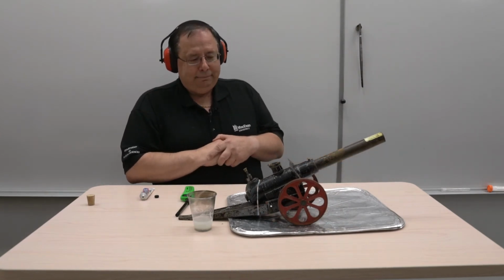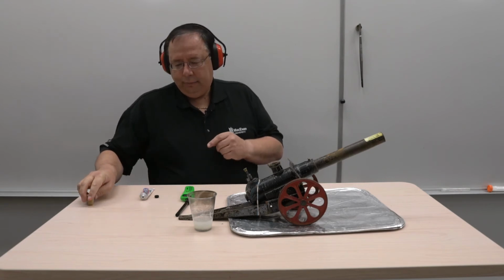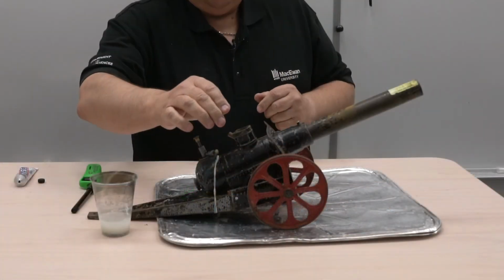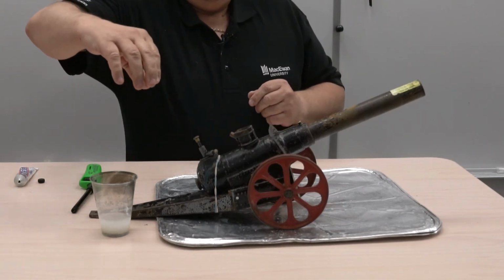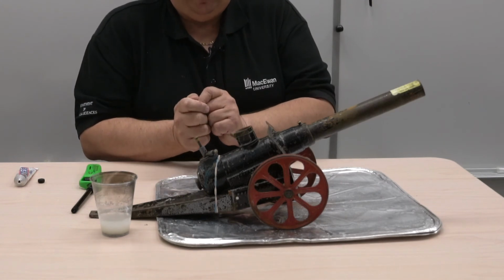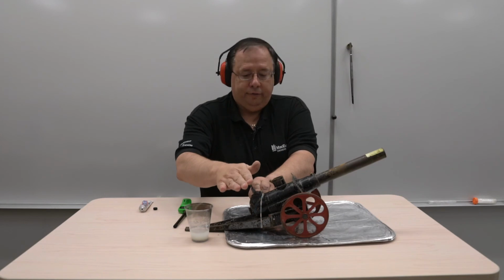Let's do the reaction. However, in this case here, I'm going to actually modify it slightly. I've got a cork, and I'm going to put it at the end of this container. So we'll now take this and press it once. A little bit of solid has gone in there. Some acetylene has formed. We now just have to ignite it. Are we ready? And in 3, 2, 1, fire.